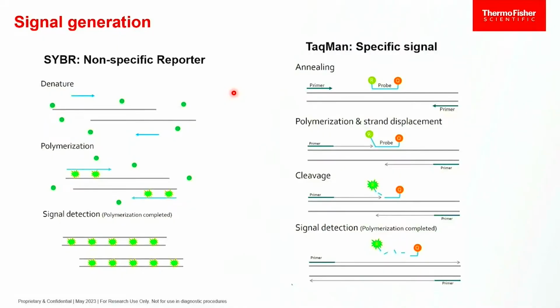No. So I think you're trying to combine Sanger sequencing with qPCR, and no, they work a little differently because it's about getting fluorescence without background fluorescence.